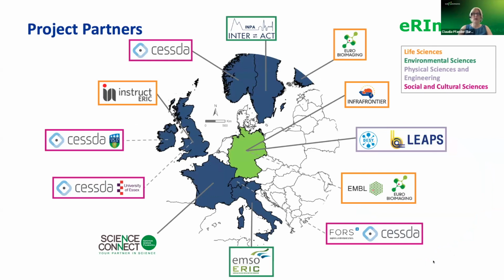You can see here on the map the project partners. And we, among the project partners, we teamed up here, Euro-BioImaging, with Instruct Eric, because we are both offering electron microscopy services, and both have a range of facilities that provide access to EM, and thought that this would be a very useful training for this community.